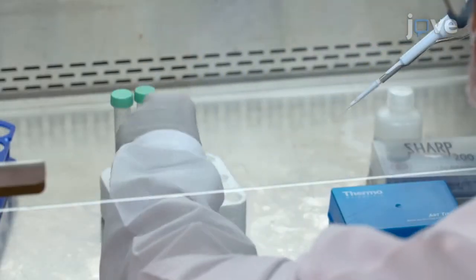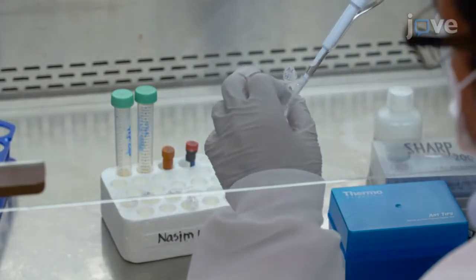Stain 2 times 10 to the fifth power of both uninfected and baculovirus infected SF9 cells with 0.5 milliliters of appropriate staining solution.